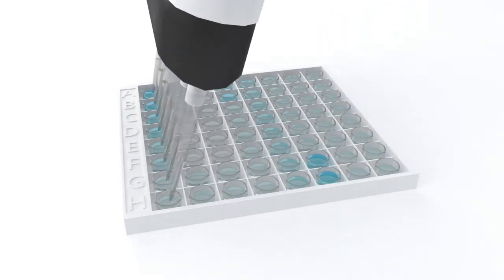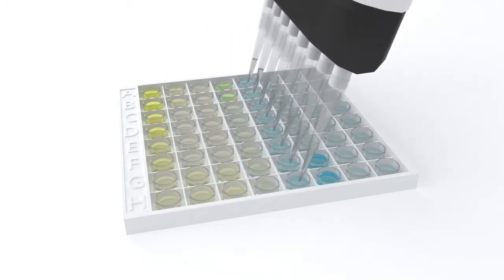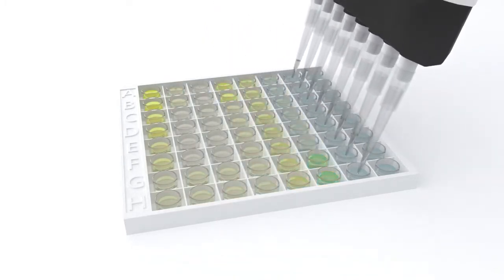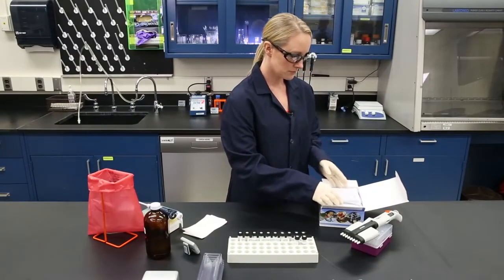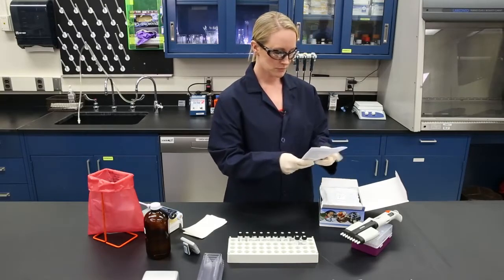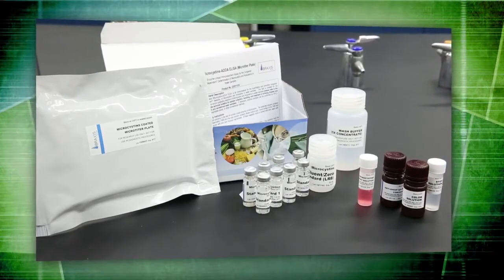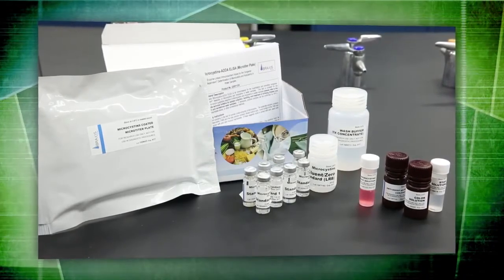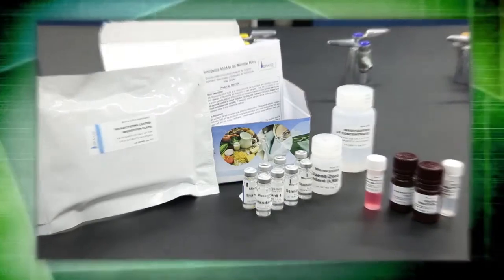We are starting with individual samples that have had any cyanobacteria cells ruptured or lysed. Please note that the ELISA described here is specific for detecting a broad range of microcystins containing the ADDA structure and a related toxin, nodularin. Your ELISA kit may be slightly different and may be tailored to a different group of cyanotoxins, but the equipment, consumables, and procedures will generally be similar to those described here.